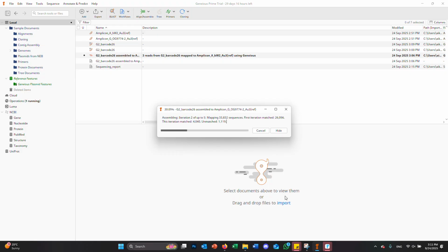If you go to the right hand side of the alignment, there are some little tabs you can look at, and there's a percentage. 99.7, 99%. So we're really matching well to the Australian isolate. That's telling us something: our sequence matches really well to the Australian isolate.